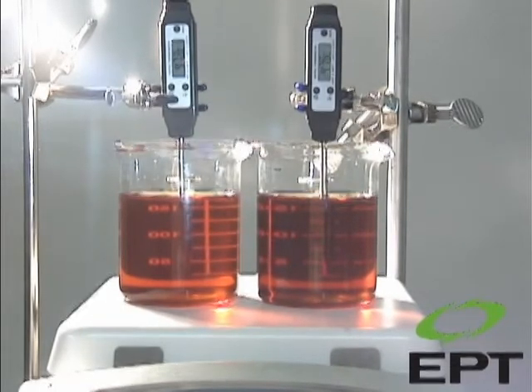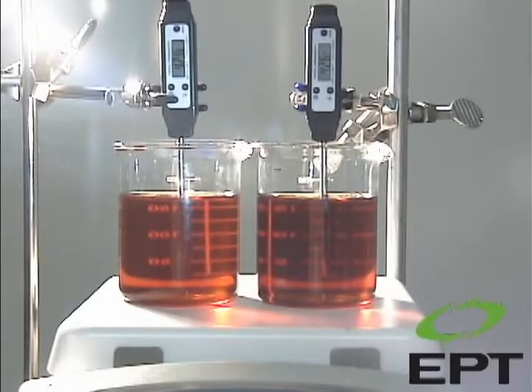We have taken an oil sample from a turbine that has an MPC value of 34. We have divided the sample into two glass beakers, each of which has a thermometer. The sample on the left-hand side has been treated with our Soluble Varnish Removal Technology, or SVR for short, while the sample on the right-hand side has not been treated.